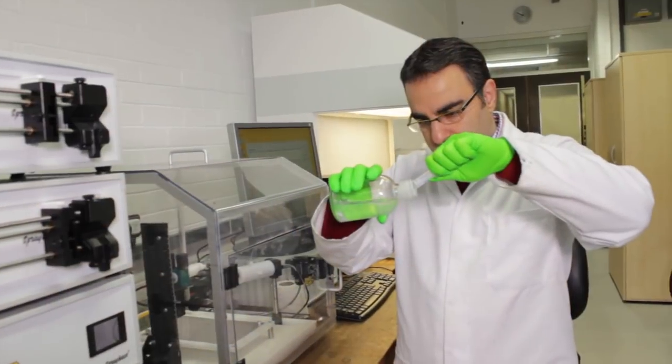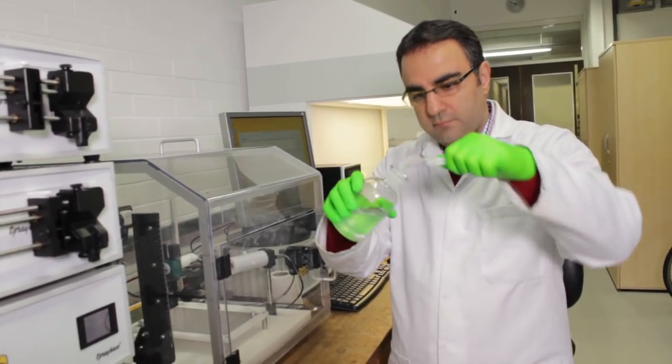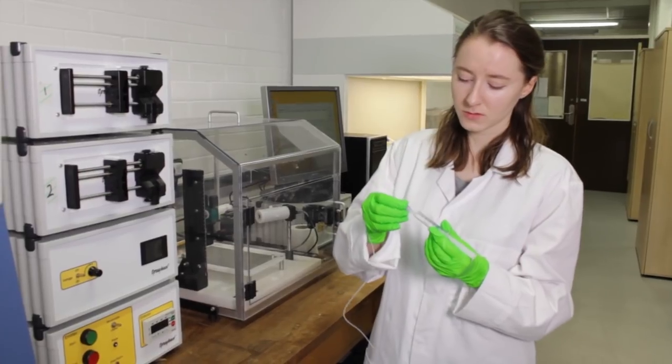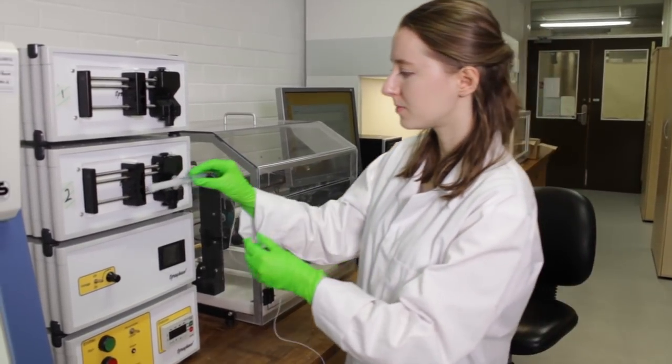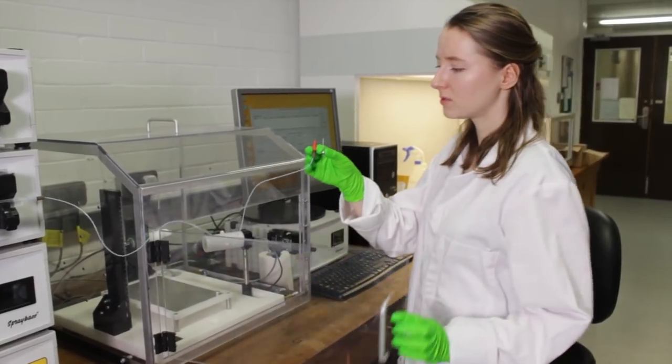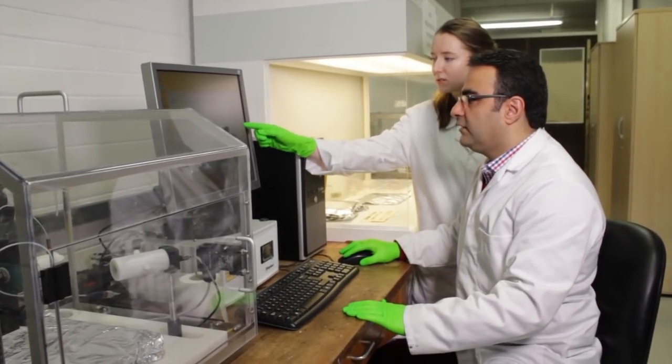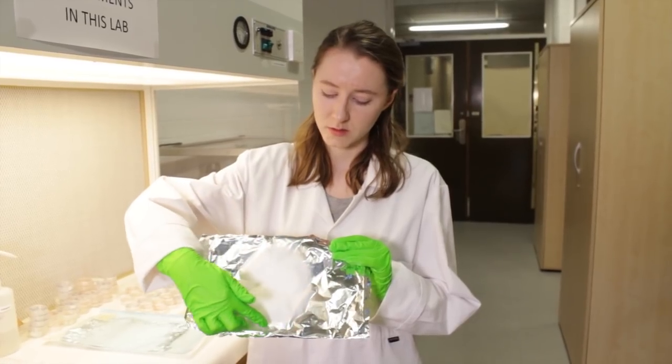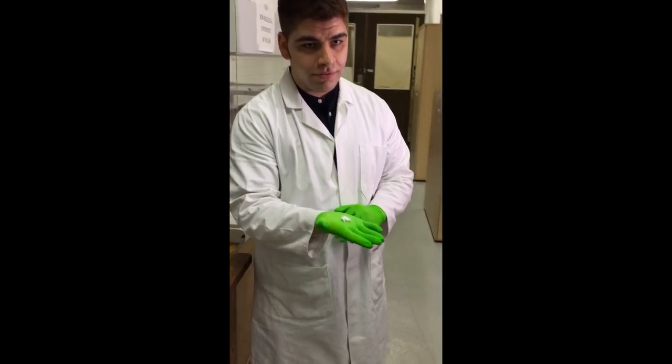Polymer solution was transferred into a 5ml syringe. The syringe was connected to a pump and tubing. The flow rate and camera were adjusted and the electrospinning started. This is an example of electrospun sheet or tube.